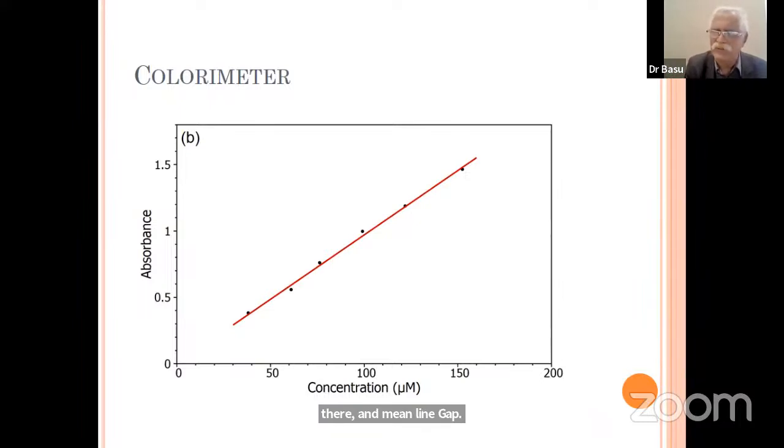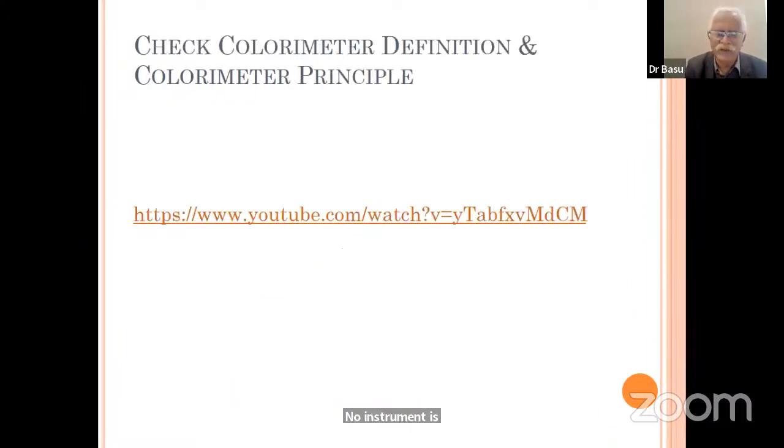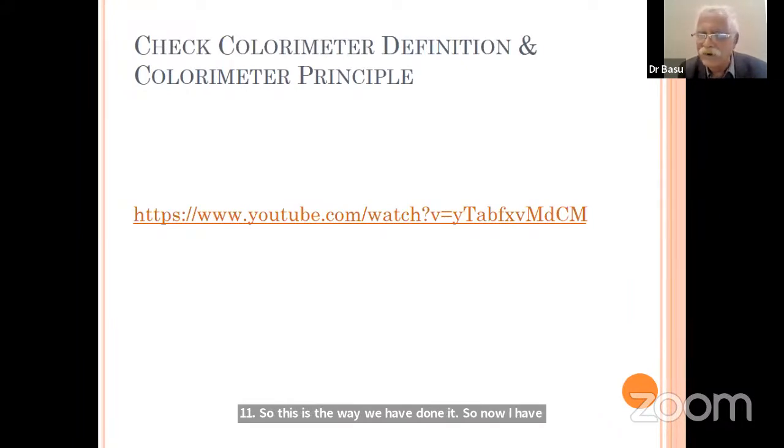Now you don't have to do these things. Now the instrument is doing it; the instrument company is giving the digital one. So this is the way we have done it. I have a small colorimetric principles demonstration. I am showing you the colorimetric principles. The madam will show it, and you will find how the instrument works, measuring color.